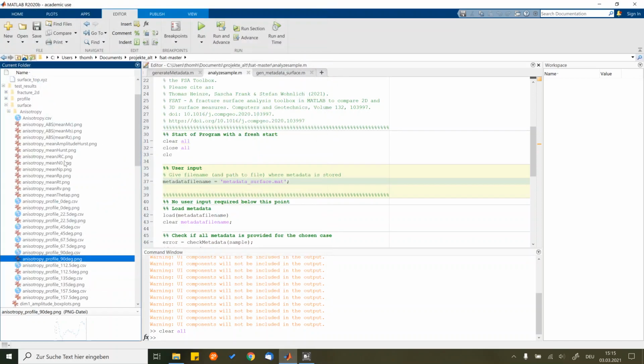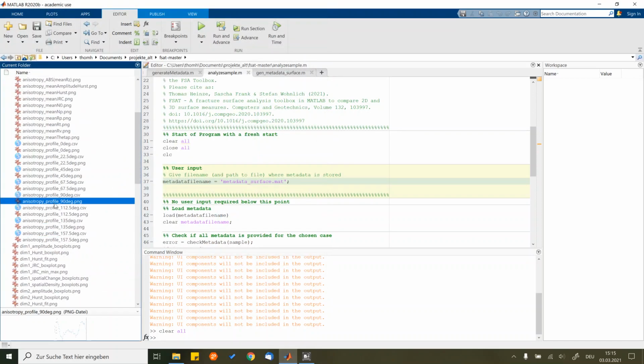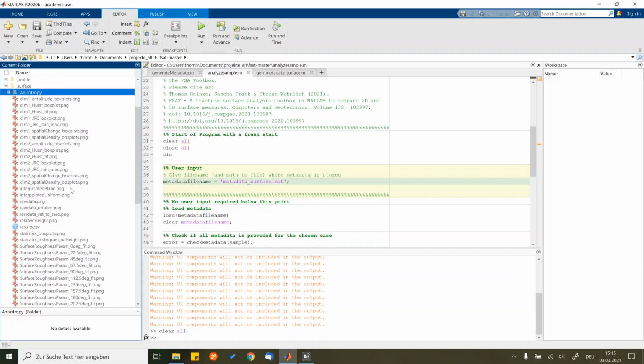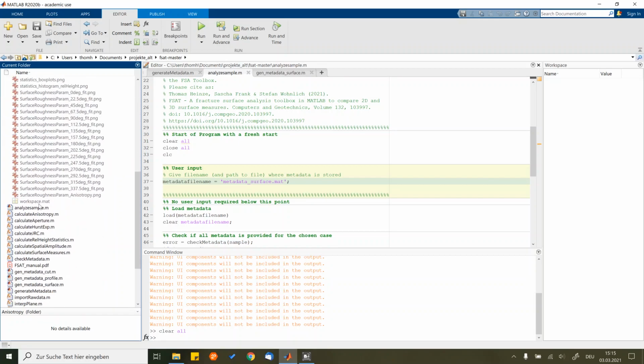That's why we provide you with this information. Right, and again, you will find all results in the CSV file if you need the quantitative analysis. But we have this also, again, in this workspace variable.